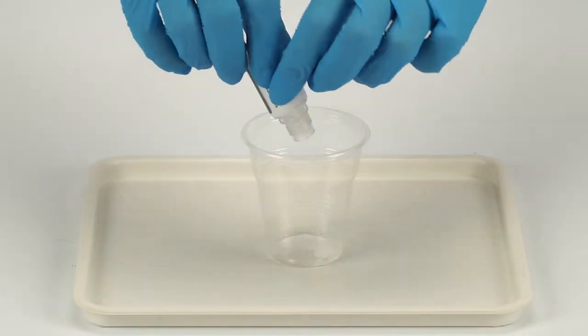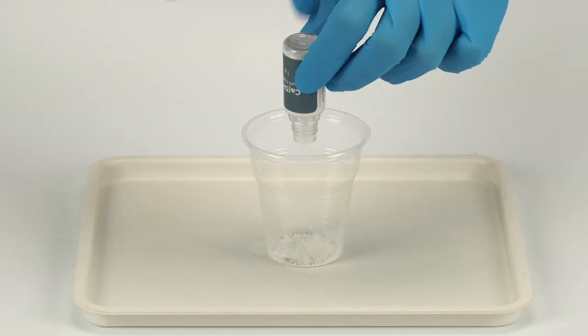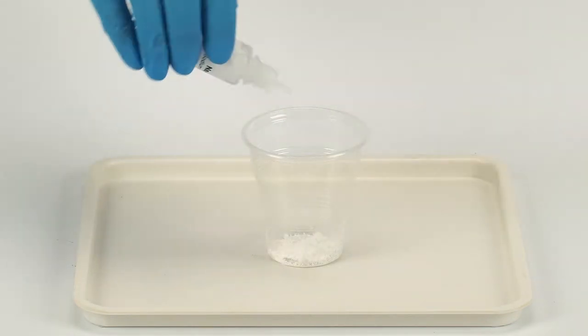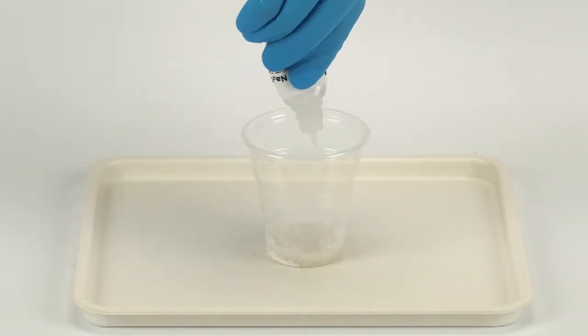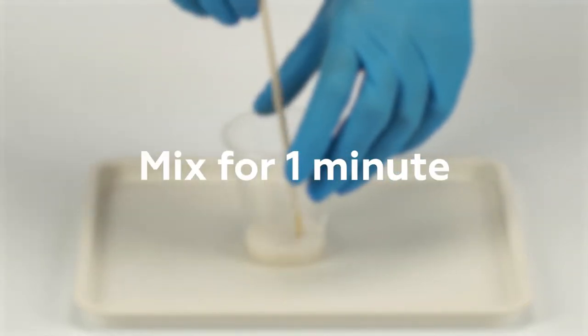First, prepare the alkali solution. Empty the bottle of calcium hydroxide into a plastic cup. Add one bottle of sodium carbonate. Mix the two reagents for one minute using the wooden stick.